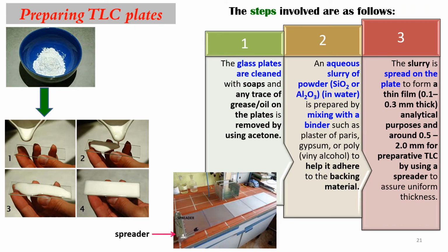Okay, this is how you nak buat preparing the TLC plate. So kalau nak buat sendirilah, kalau ada yang kawan awak tengok video tu kan, dia buat sendiri. Macam ni lah cara dia buat sendiri. Dia tekan, tapi this is step involved lah. So biasa kita guna spreader ni lah. Spreader ni paling bagus sekali, because spreader ni akan maintainkan dia punya ni kepada film thickness of the film tu akan uniform.